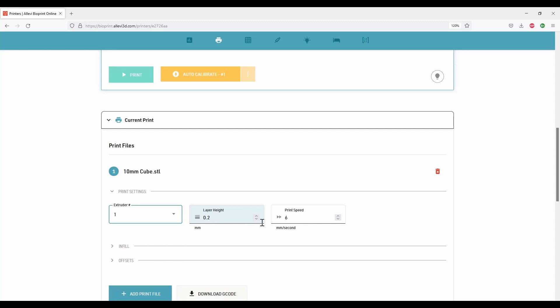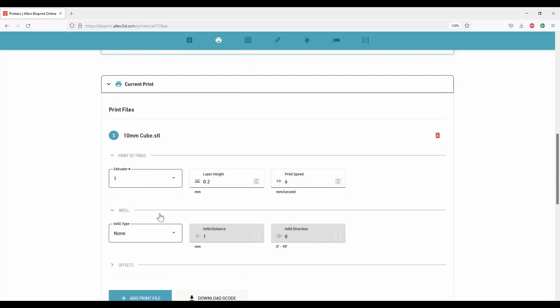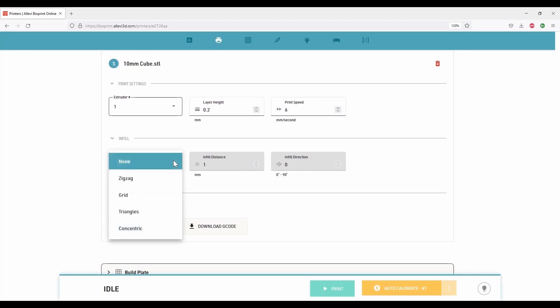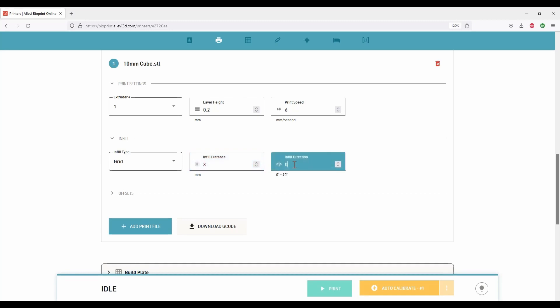Under the extruder section, we can calibrate the tip of the needle and print speed can be changed as needed. Next is the infill settings. Choose the type of the infill from the drop-down. Here, I'm choosing grid infill. Infill distance is the distance between the extruded fibers. I will set it to 3 millimeters. You can change the infill direction by adjusting the angle.